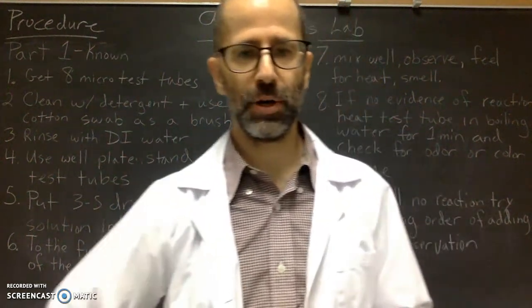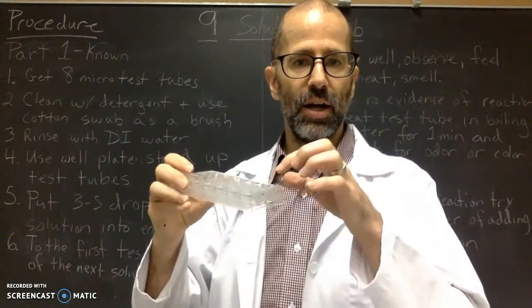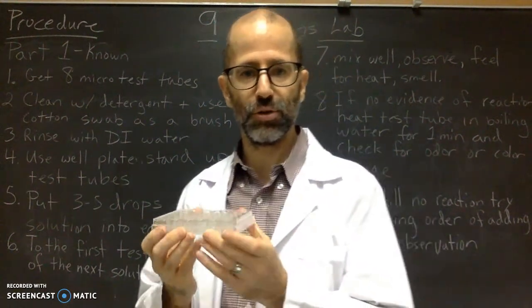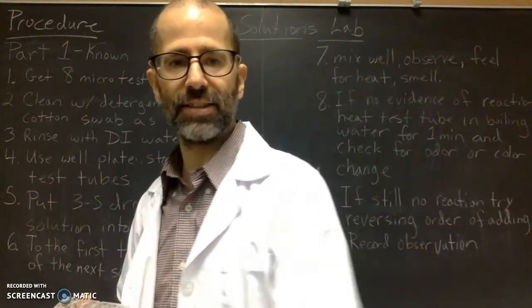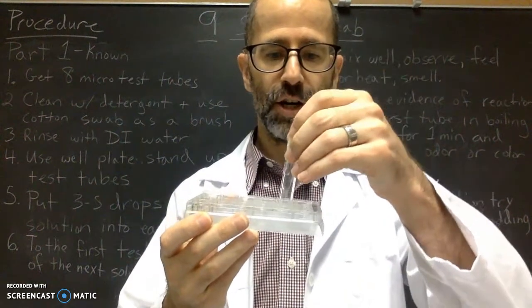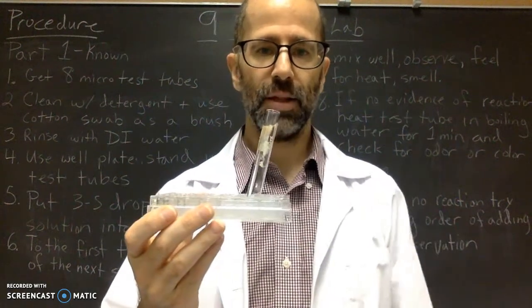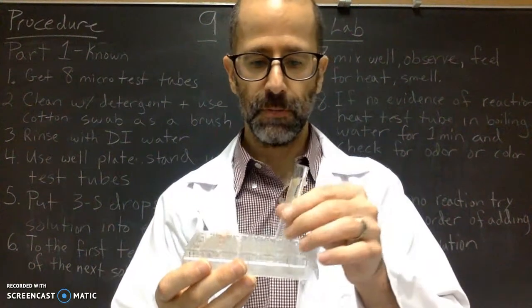I know if you've had experience with well plates, a lot of times you'll put the chemicals directly in the well plate and you'll mix them and you'll see a reaction. We're not going to do that. So the well plate is there as kind of a miniature test tube holder. So again, you're going to put your test tube in the well plate. Again, this is a bigger test tube, but just to give you an idea, the well plate is going to hold up your micro test tubes, okay?